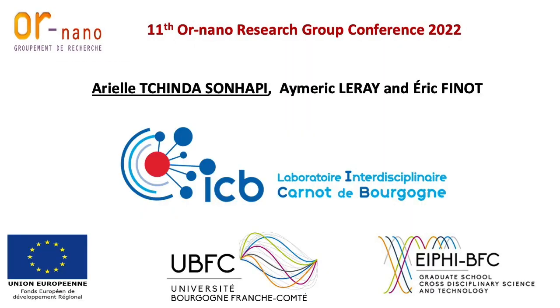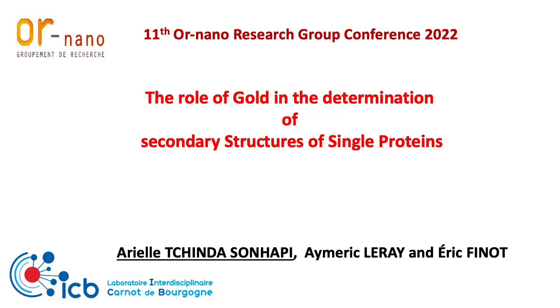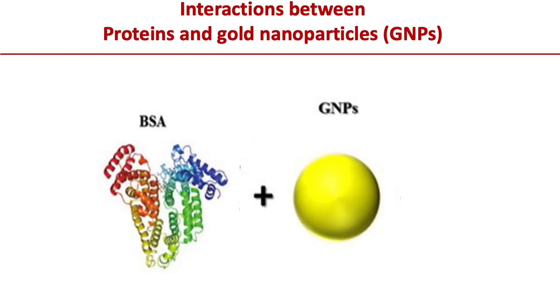Today, we talk about the role played by gold nanoparticles. How can we use gold nanoparticles to determine the structures of proteins using an optical spectroscopic approach? SERS, the Surface Enhanced Raman Spectroscopy. Understanding the interaction between protein and gold is of fundamental interest.